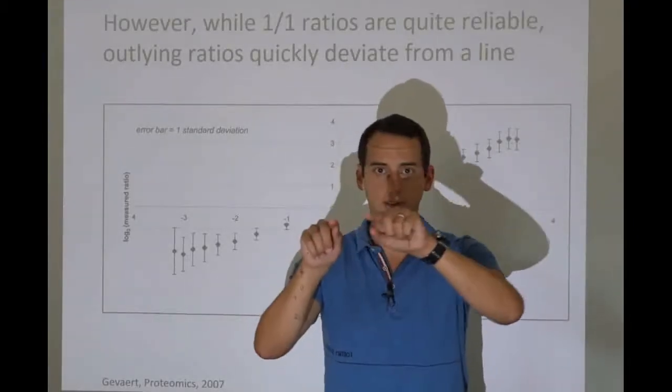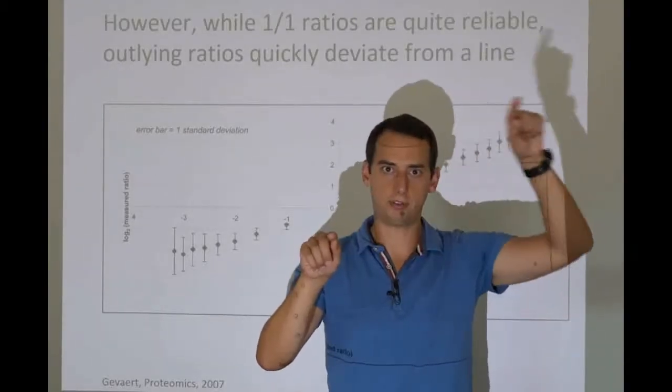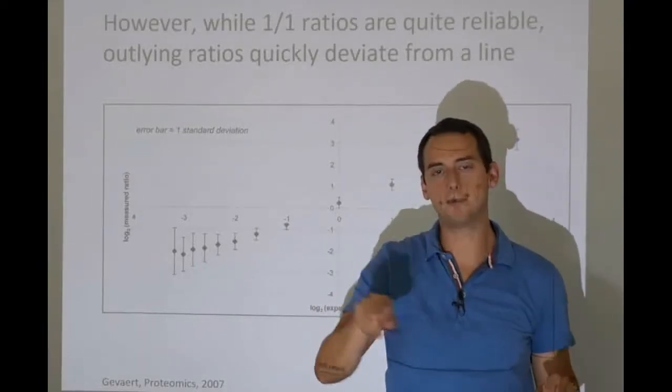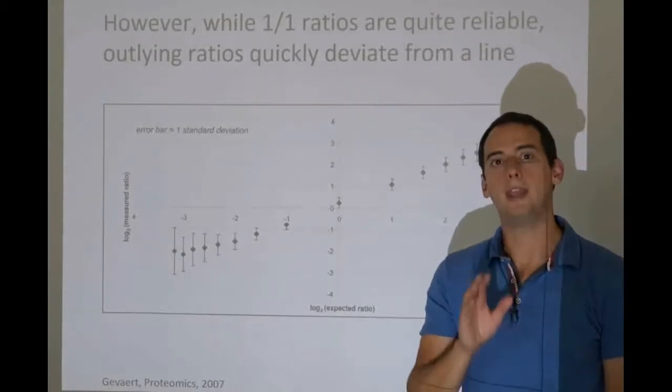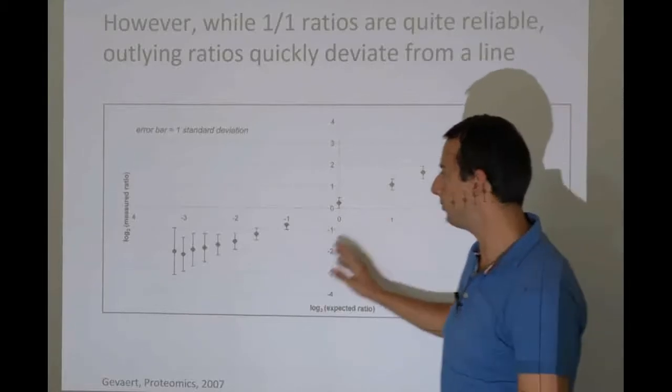So again, we have a detection curve that follows this S-shaped curve. And that is what we call a sigmoid curve, because it looks like an S, like a sigma in Greek. And this is very typical of any detector. It is therefore also typical of a mass spectrometer detector. So this is what you see here.